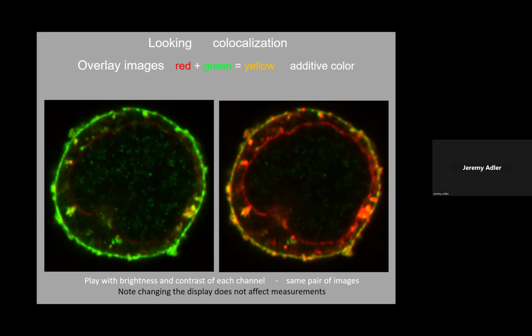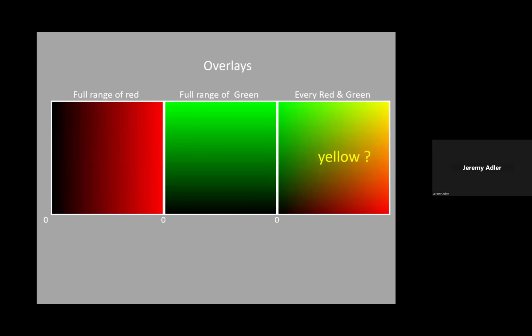What this is saying is that you can display things in an informative way, but there is considerable scope for choosing and therefore bending what is presented. But of course, this is only a picture. It's not a measurement. Measurements are harder to distort than simple pictures.